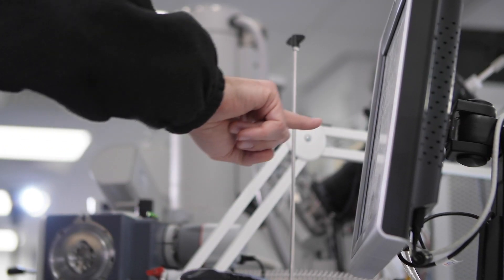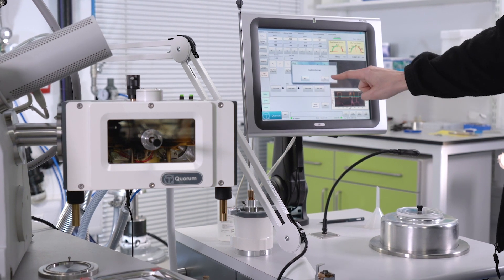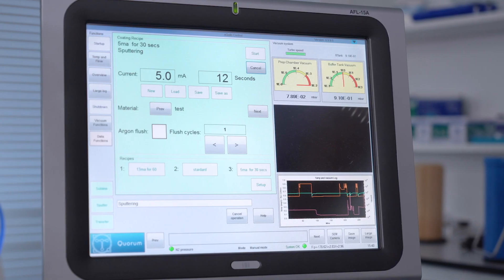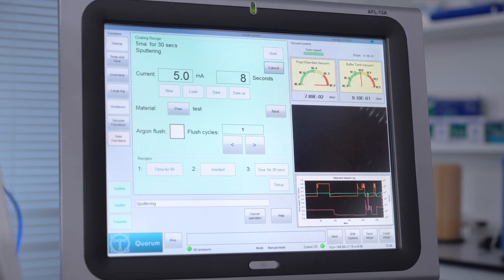Because the system is controlled by a touchscreen PC, all parameters are continuously logged and saved to the hard drive. With an internet connection, the system can be run remotely from the factory for training, diagnostics, and software updates.